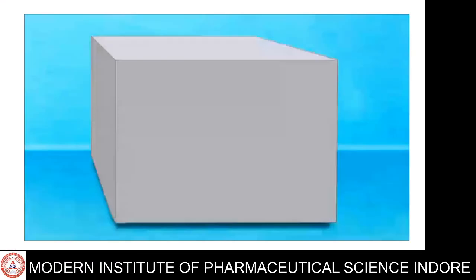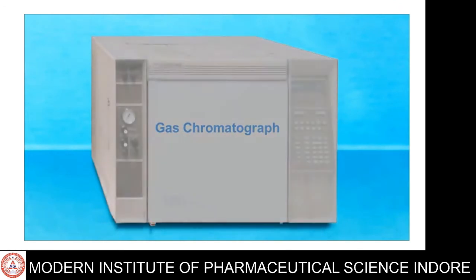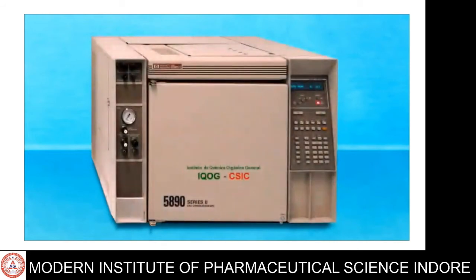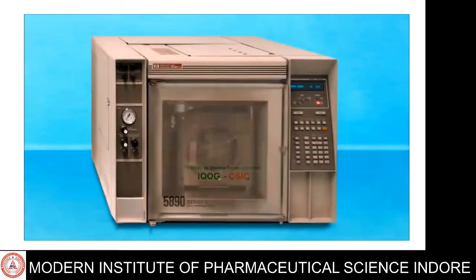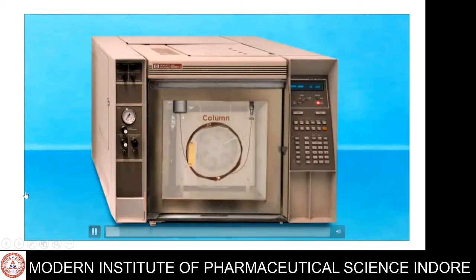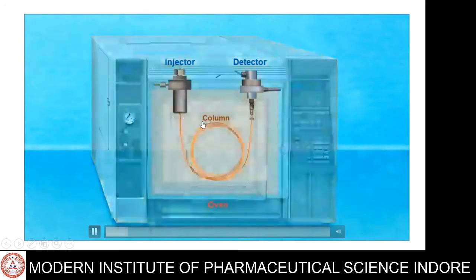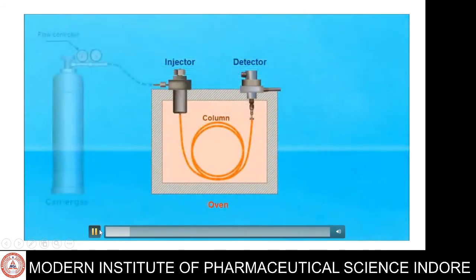So here is the video of the gas chromatographic system, showing how to perform gas chromatography. The oven is attached, which holds the separation column. The heart of gas chromatography is the column, which is made of metal bent in a U shape or coil shape, open spiral or flat pancake shape.